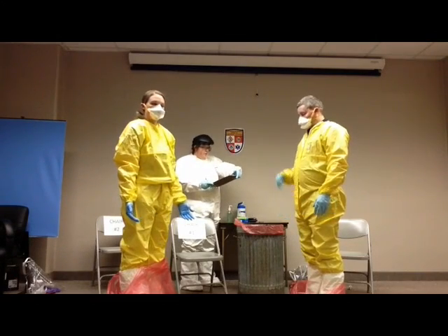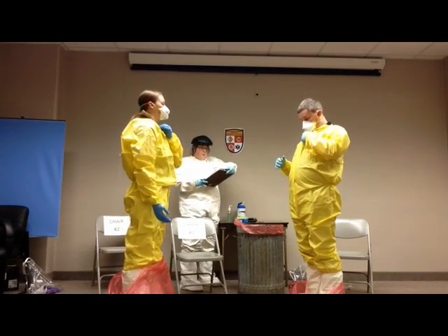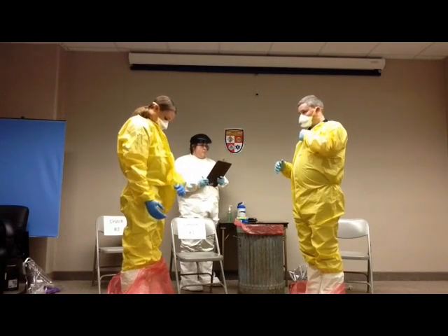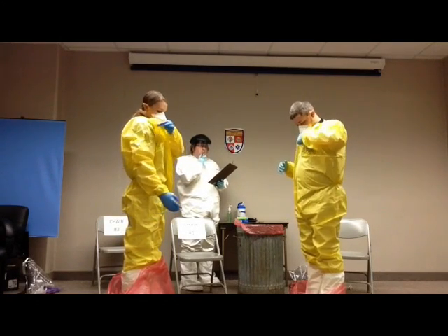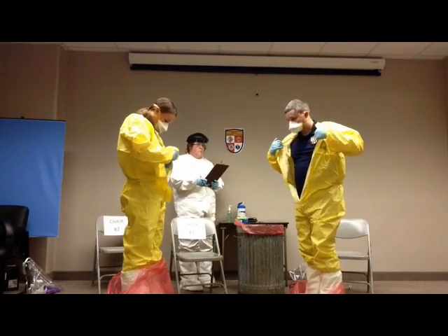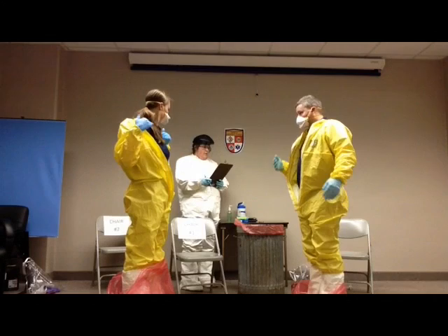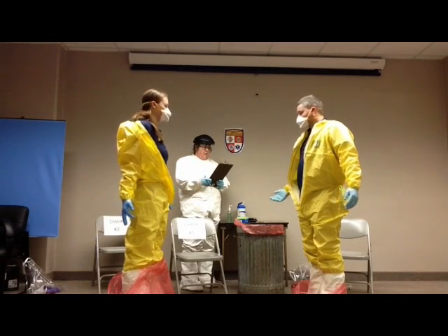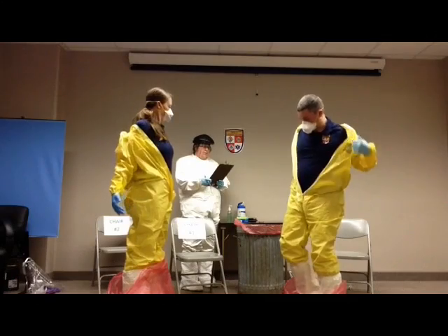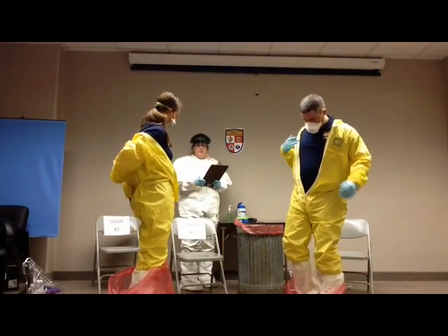Open zipper seal if used, and carefully unzip suit while minimizing contact with outside of coverall. Avoiding contact with outside of coverall, pull arms from sleeves and push coverall below the waist. Trained observer may assist with this process.